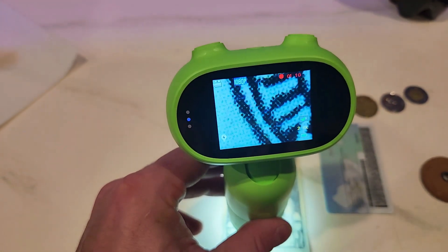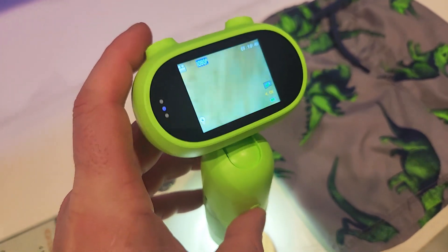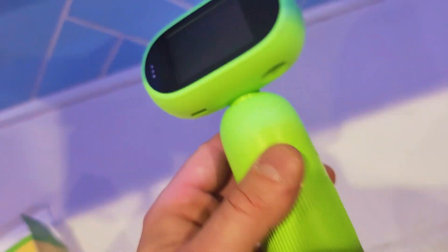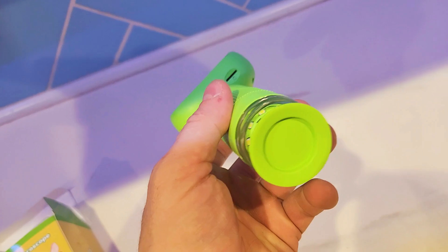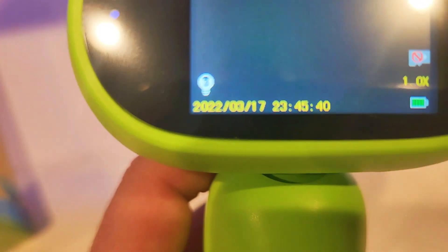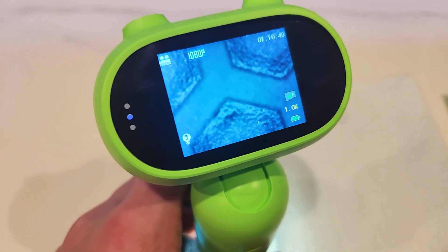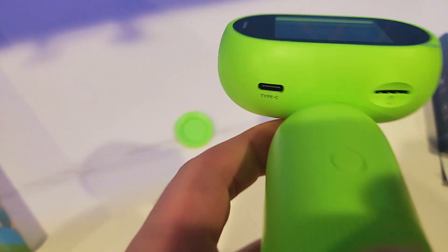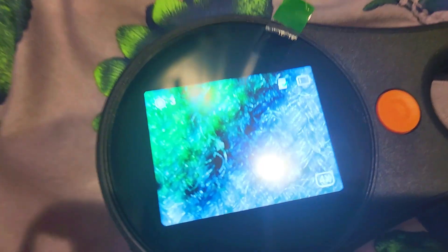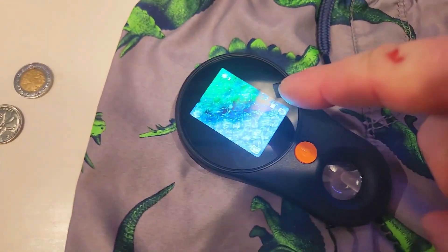What's up everybody? On today's video I'm going to show you a super cool gadget for your kids who love to explore, or somebody who's into science or biology. We have this handheld 1000 magnification kids microscope. It's got a built-in 2-inch screen that allows you to see everything in real time. You can also record videos directly onto the SD card and take high resolution photos. It charges via USB-C, plus it really zooms in. I'm also going to show you another microscope with a 500x zoom, so stick around for the whole video.